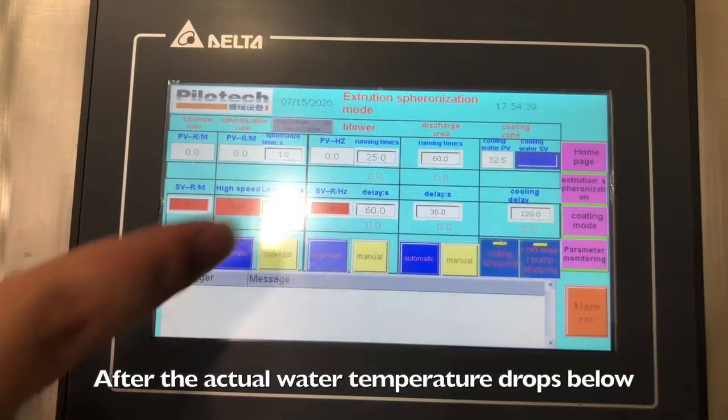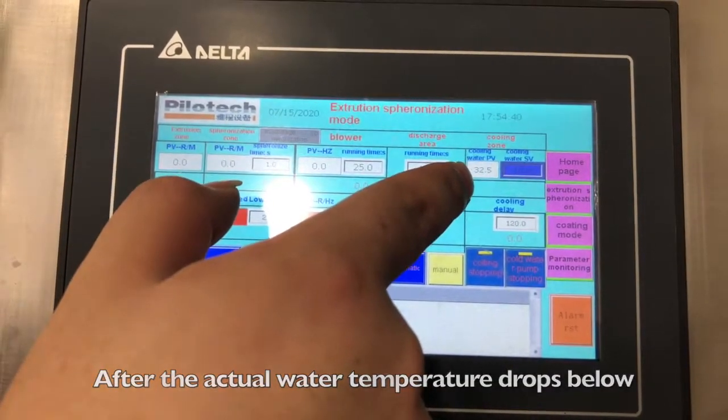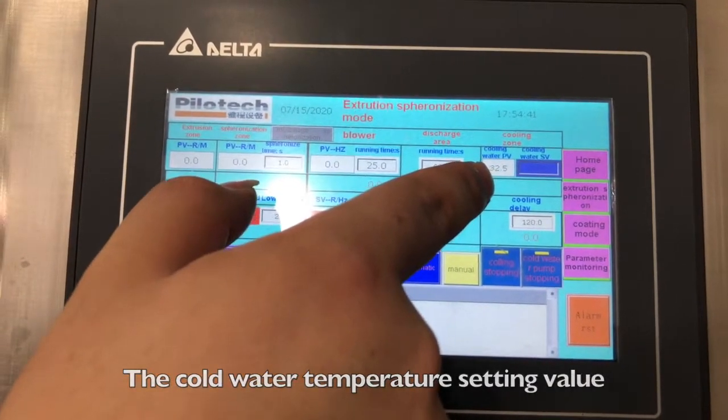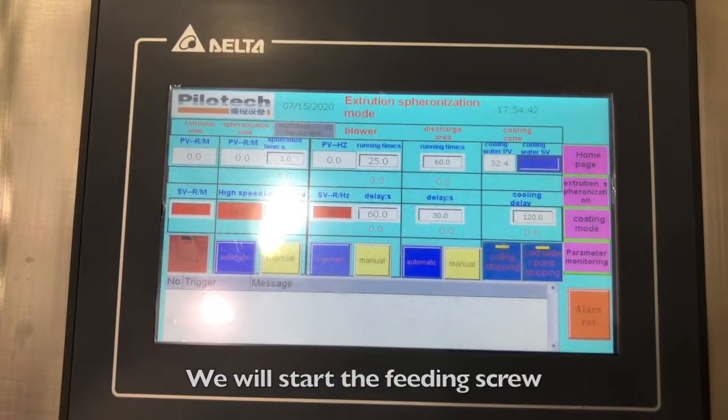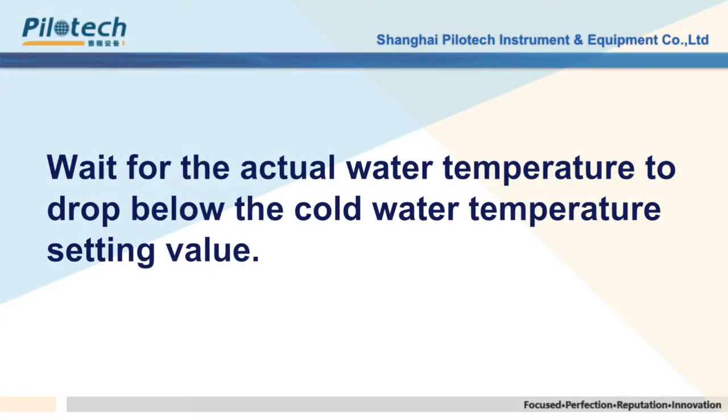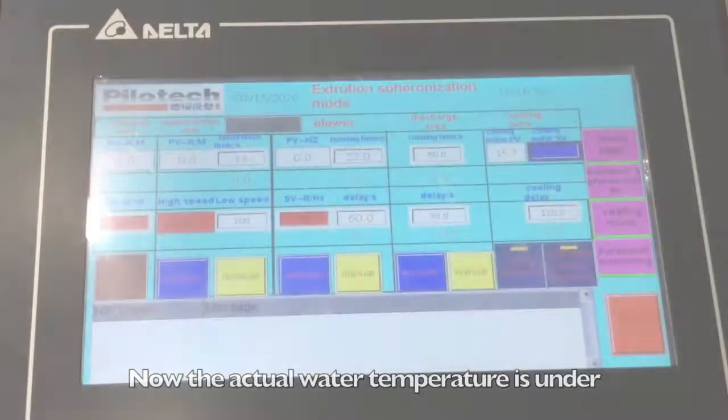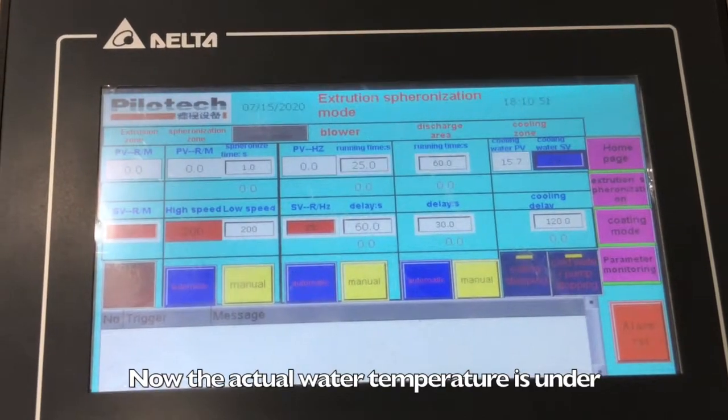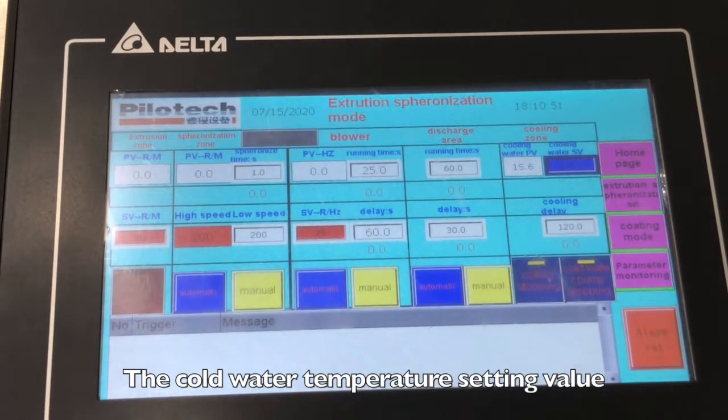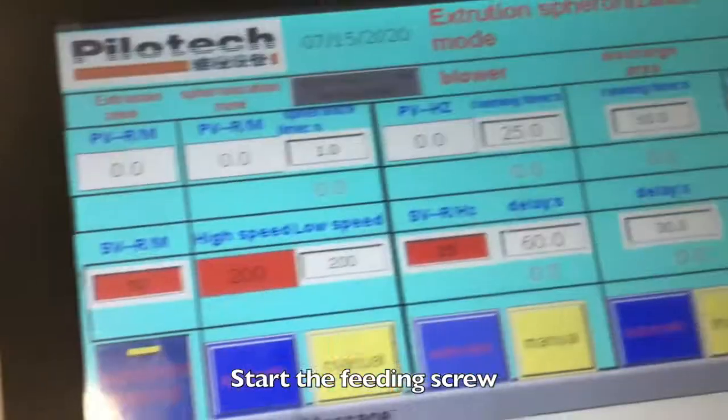After the actual water temperature drops below the cold water temperature setting value, we will start the feeding screw. Now the actual water temperature is under the cold water temperature setting value. Start the feeding screw.